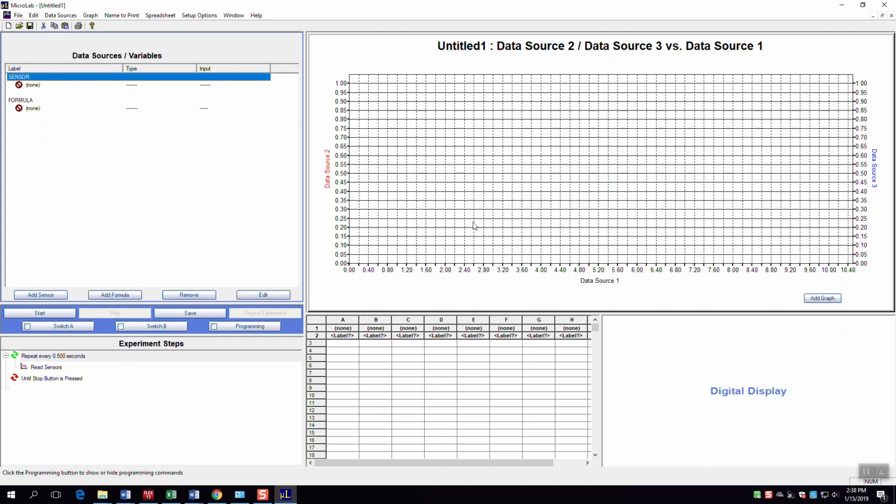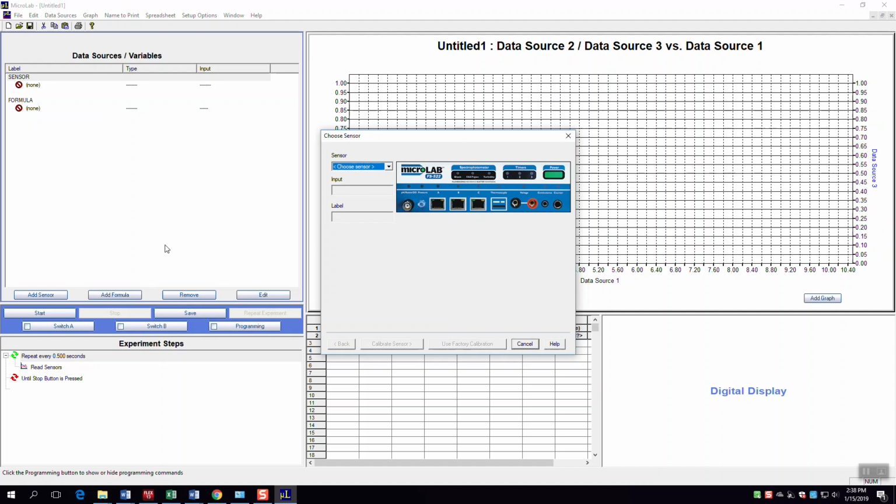In this experiment, we're not going to use a lot of this screen. You can use it to make measurements at certain times, make graphs, or export your data to Excel. But in this case, we're just going to be using it for some simple things. Right now, I'm going to use it to show you the difference between measuring the conductivity of tap water and the conductivity of DI water, which is something you're expected to comment on and check during your experiment.